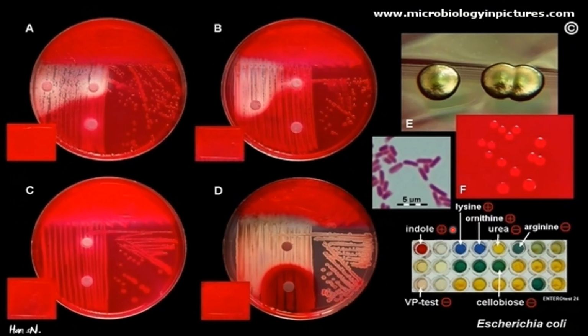And of course, here we have Escherichia coli, or E. coli. So here we have gram-negative rod shape or bacilli, and E. coli, they are actually found in the lower intestine. Most of the E. coli in the intestine are not considered harmful. Some of them are actually important for us to produce vitamins such as vitamin K. And you know, vitamin K is important for normal blood clotting.